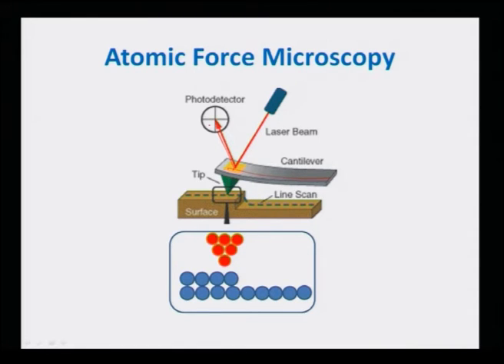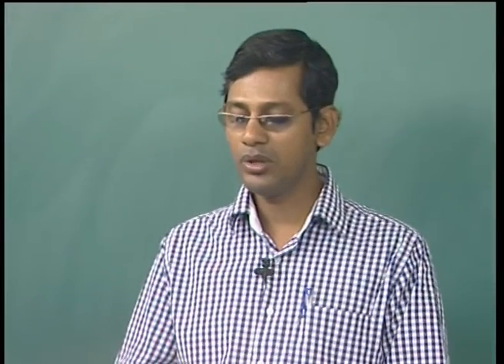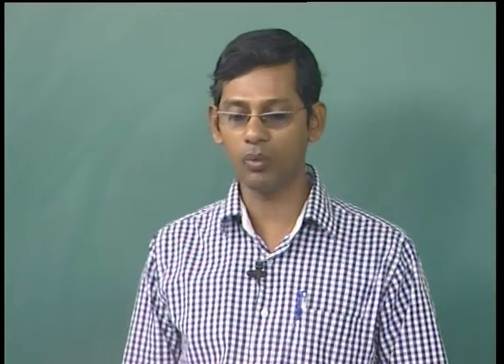And these atomic forces between the atoms of the tip, that is these red color atoms, and the sample atoms depend on the distance between the tip and the atom. It doesn't depend on whether the sample is conducting, non-conducting, or insulating, nothing. So this is basically the idea. Now I'll discuss in detail how it works.